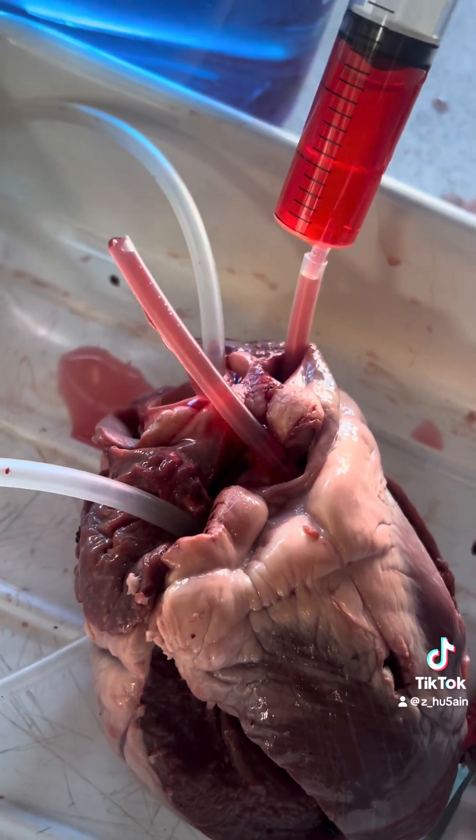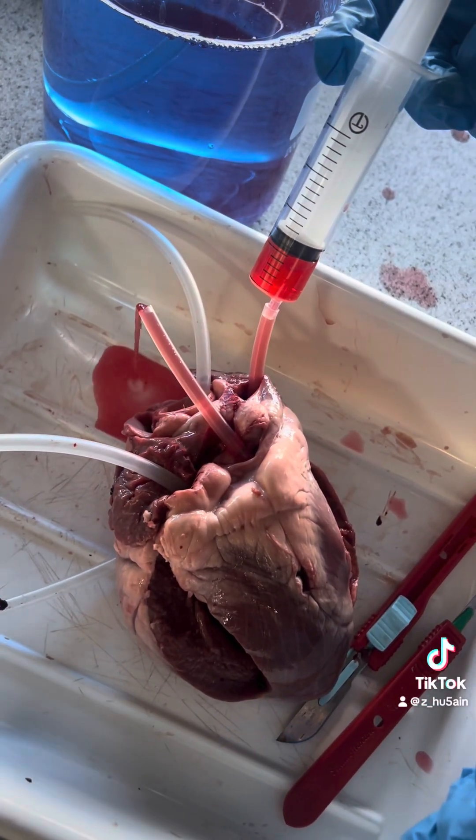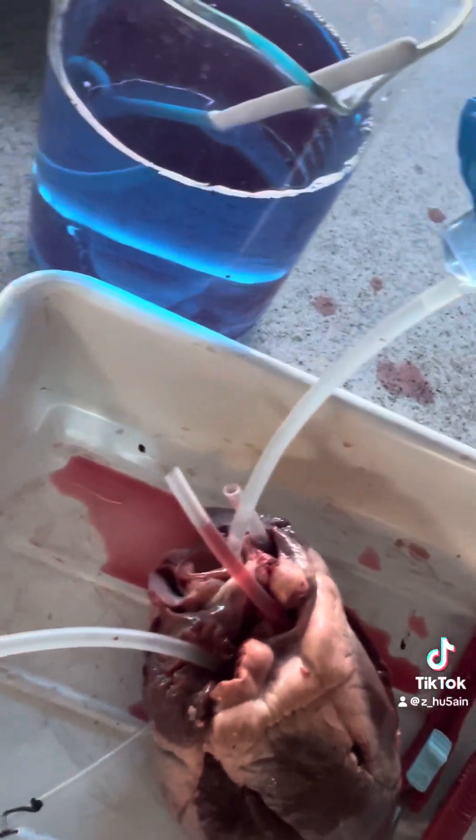Gross — is it gross? Yeah, I think that's pretty cool though. That's the blood flow. Now do the other side. And that is your deoxygenated blood.